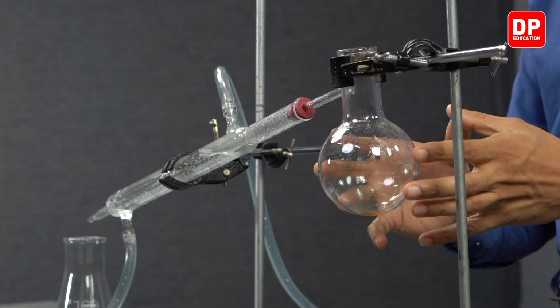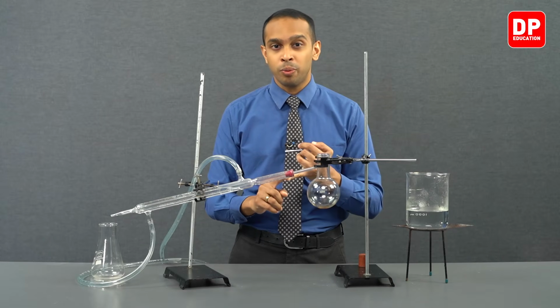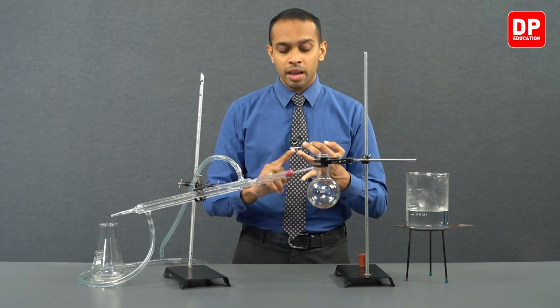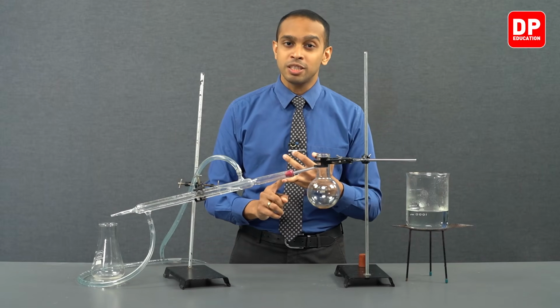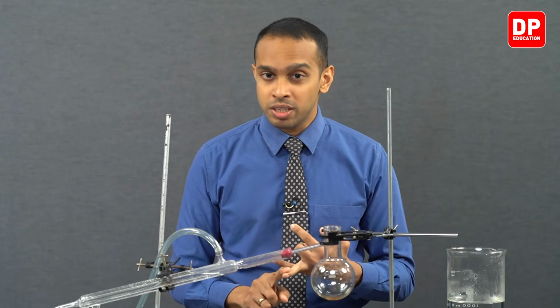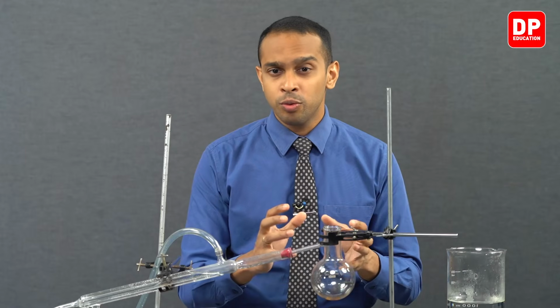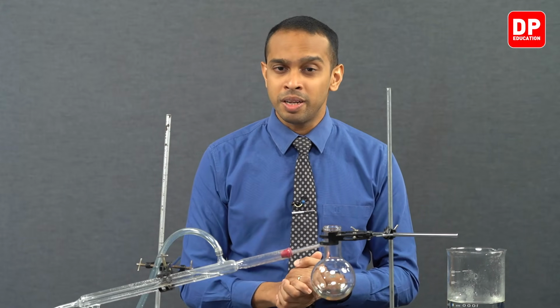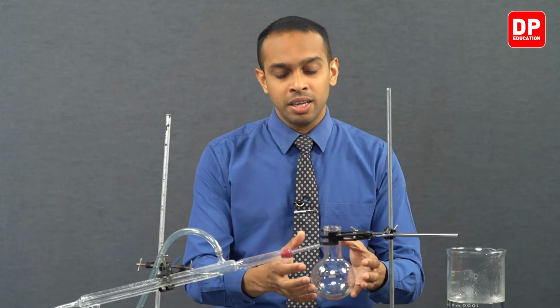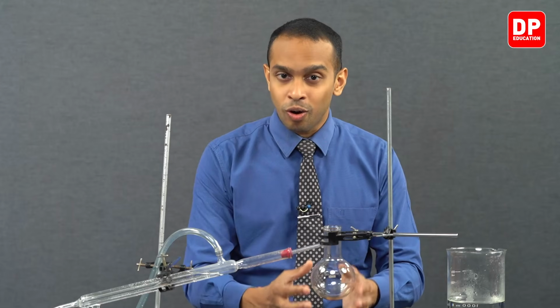So this particular mixture had diethyl ether, which has a boiling point of somewhere around 34 to 35 degrees Celsius, and it also contained the essential oil eugenol, which has a boiling point of 254 degrees Celsius. So the first thing to boil off when provided with heat to this mixture would be diethyl ether. And as we predicted, the diethyl ether got evaporated, leaving behind the essential oil.